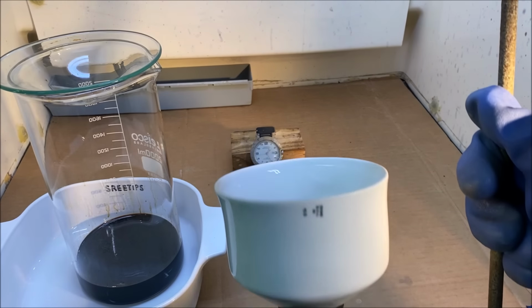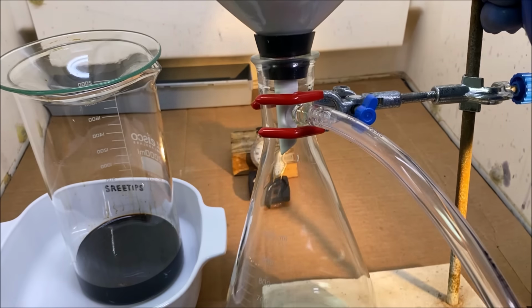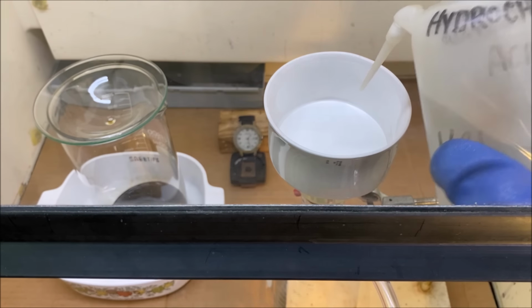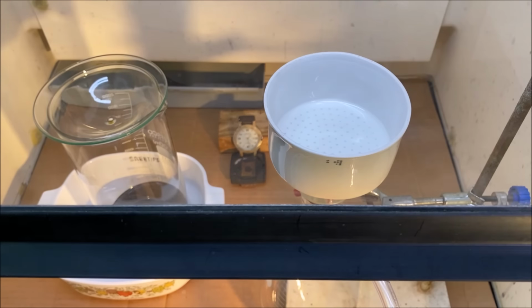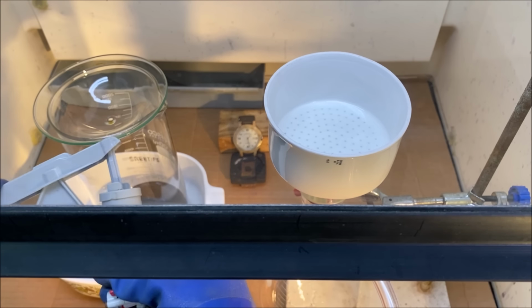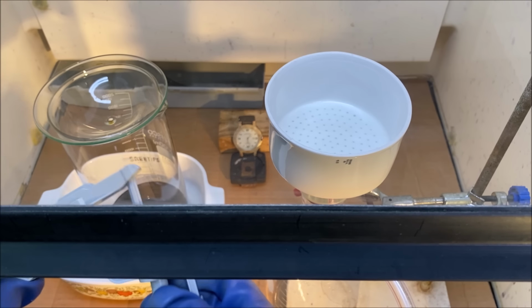Got a filter rig set up here. I'm going to dampen the filter with some hydrochloric acid. And now I've got a hand pump here. I'm going to pull a vacuum on our filter flask.